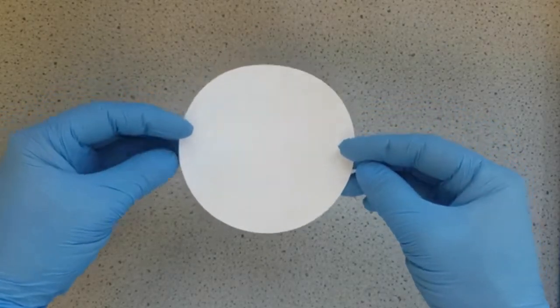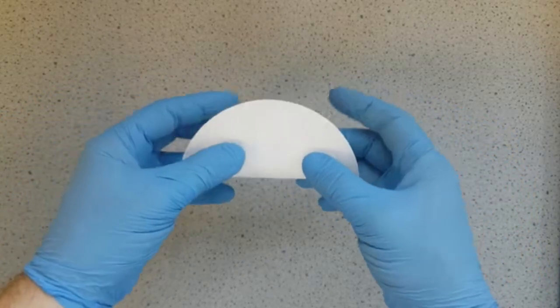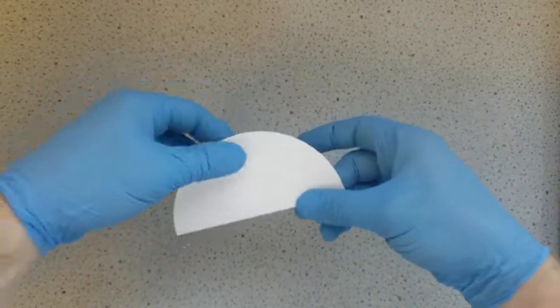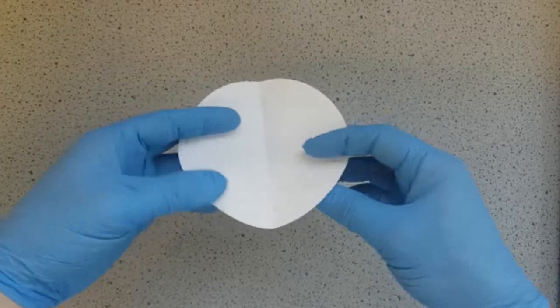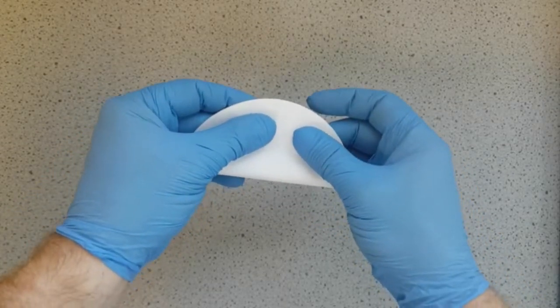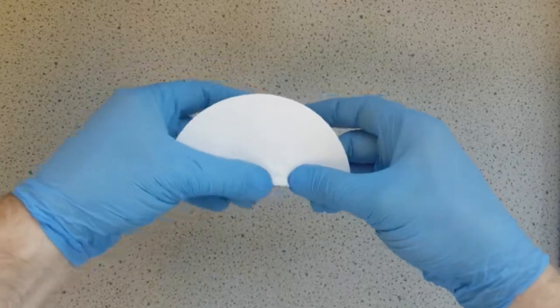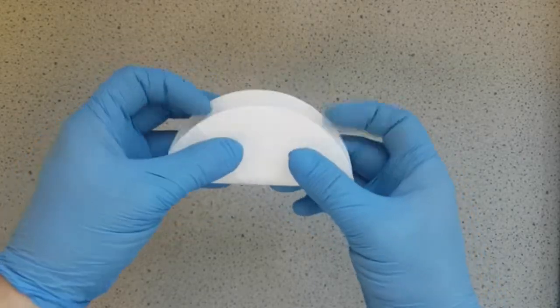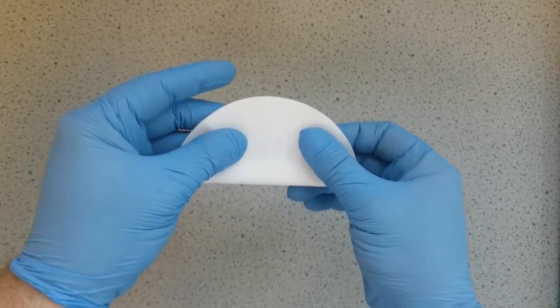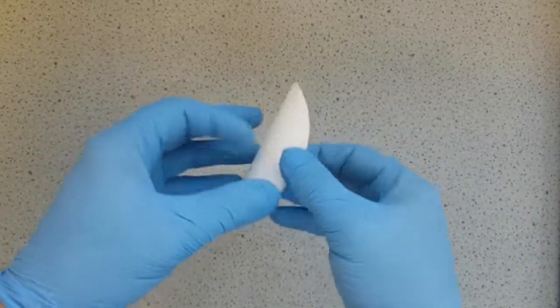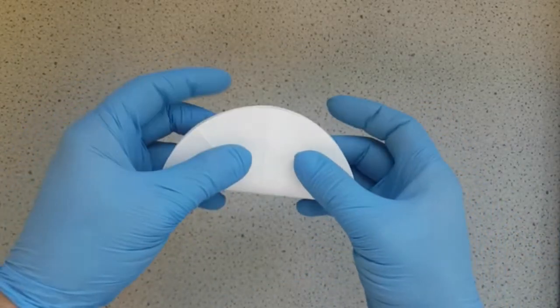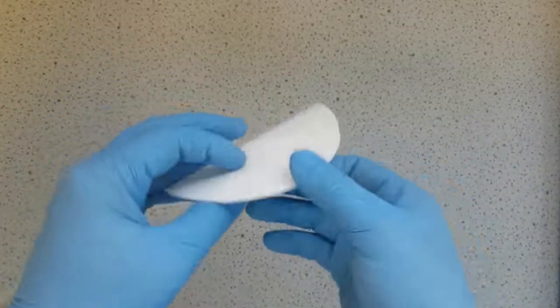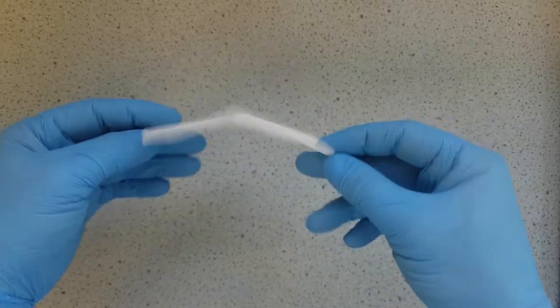So using a round sheet of filter paper we are going to fold first in half, like so, and then fold again in half to make four quadrants. We'll then repeat this twice again to create eight equal segments.